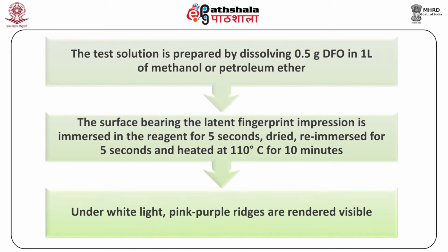The test solution is prepared by dissolving 0.5 gram DFO in 1 liter of methanol or petroleum ether. The surface bearing the latent fingerprint impression is immersed in the reagent for 5 seconds, dried, re-immersed for 5 seconds, and heated at 110 degrees Celsius for 10 minutes. Under white light, pink purple ridges are rendered visible.